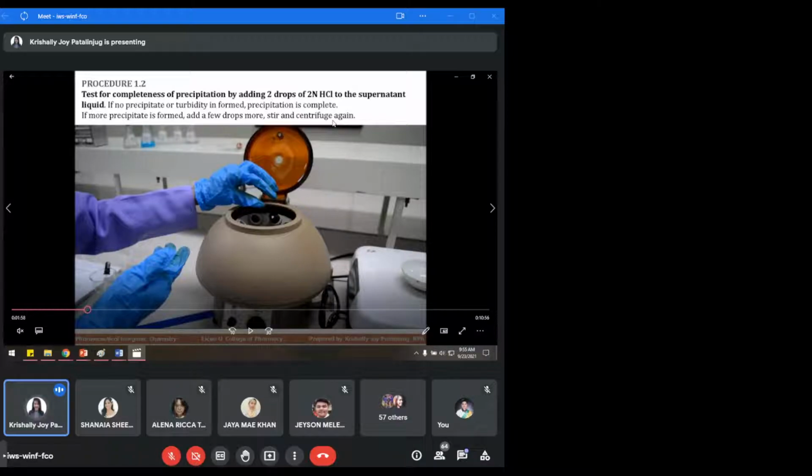Meaning, pinupull niya down yung solid. Kaya mapapadali natin yung separation ng solid to liquid. Okay, so centrifuge again, laboratory device used to separate fluid from solid based on gravity. Yung nangyayari dyan, di ba may mga vessel, kung saan nilalagay yung test tube, iikot yan. Depende kung anong speed ang sinet mo. Okay? Kung anong revolution or speed yung sinet mo.